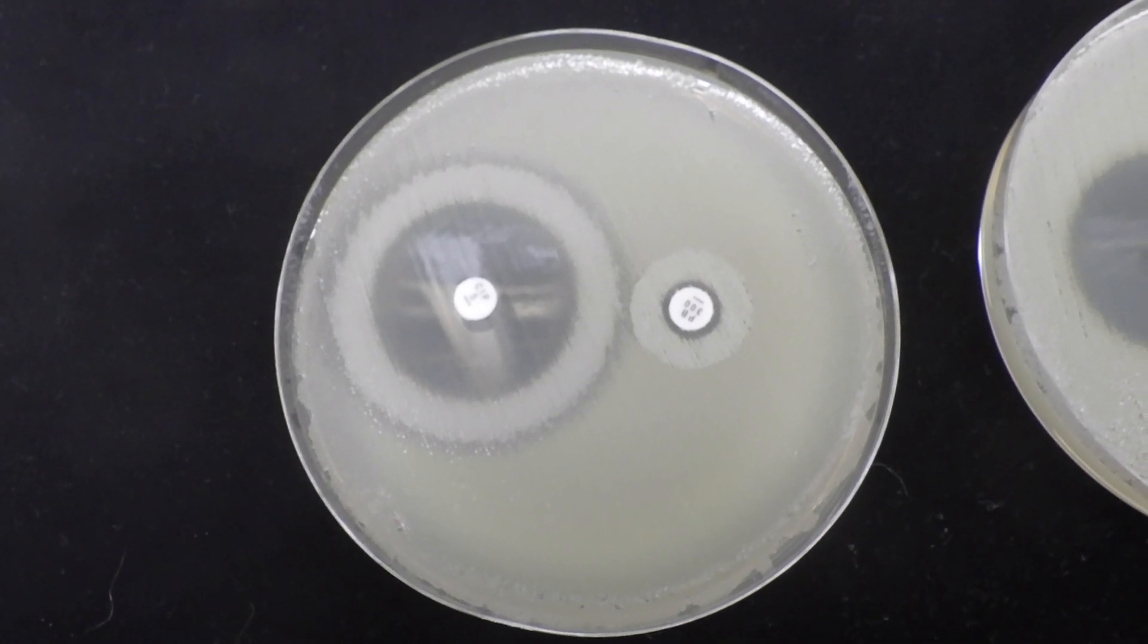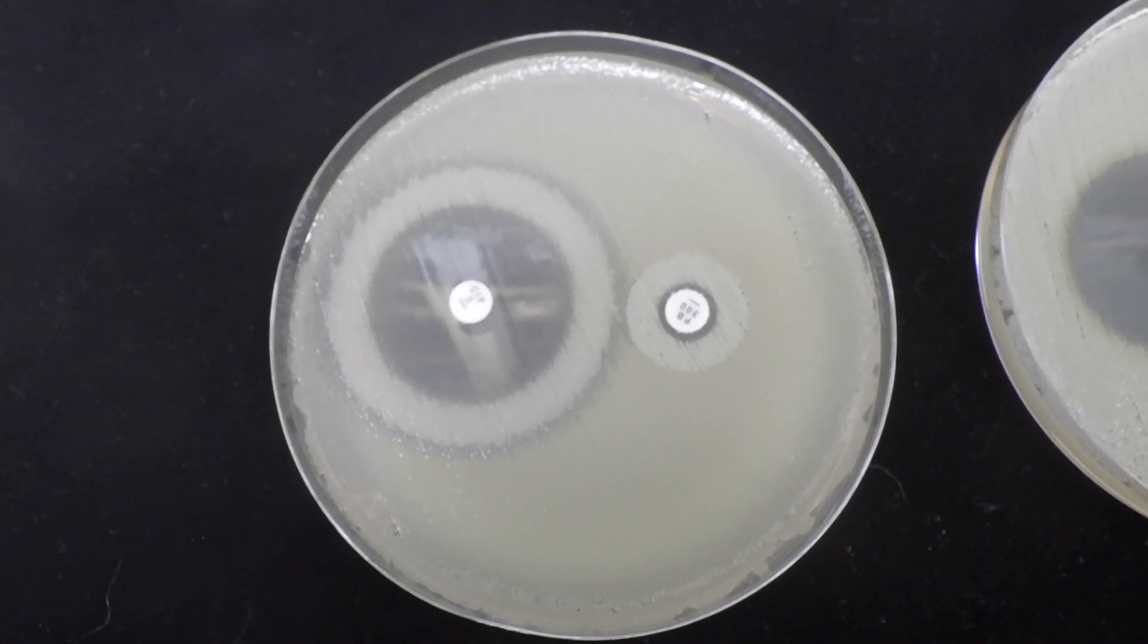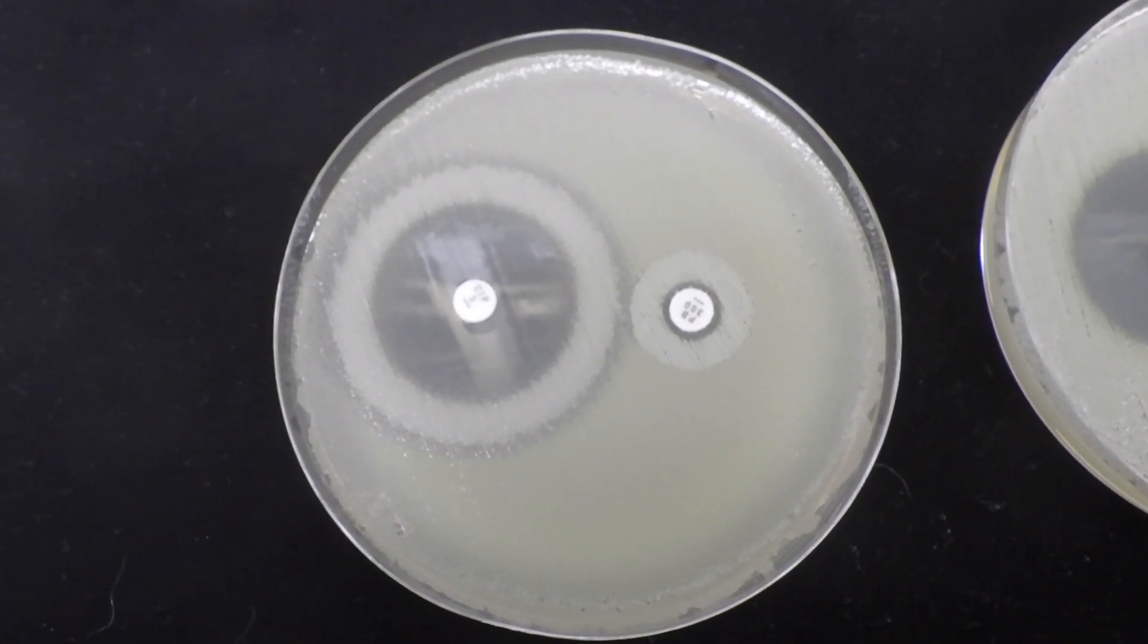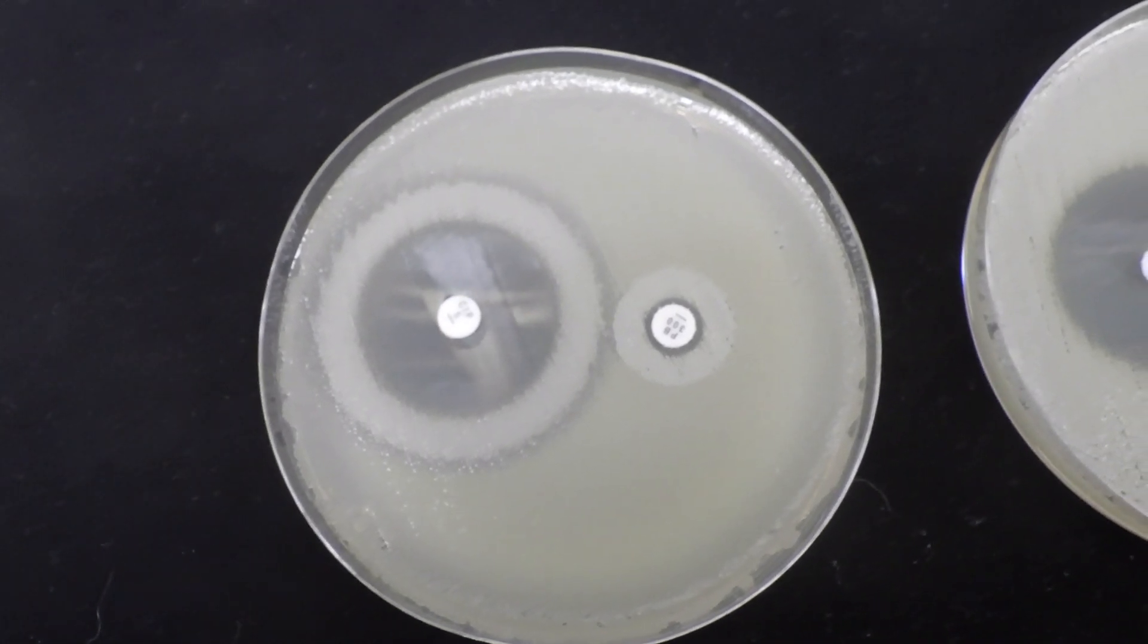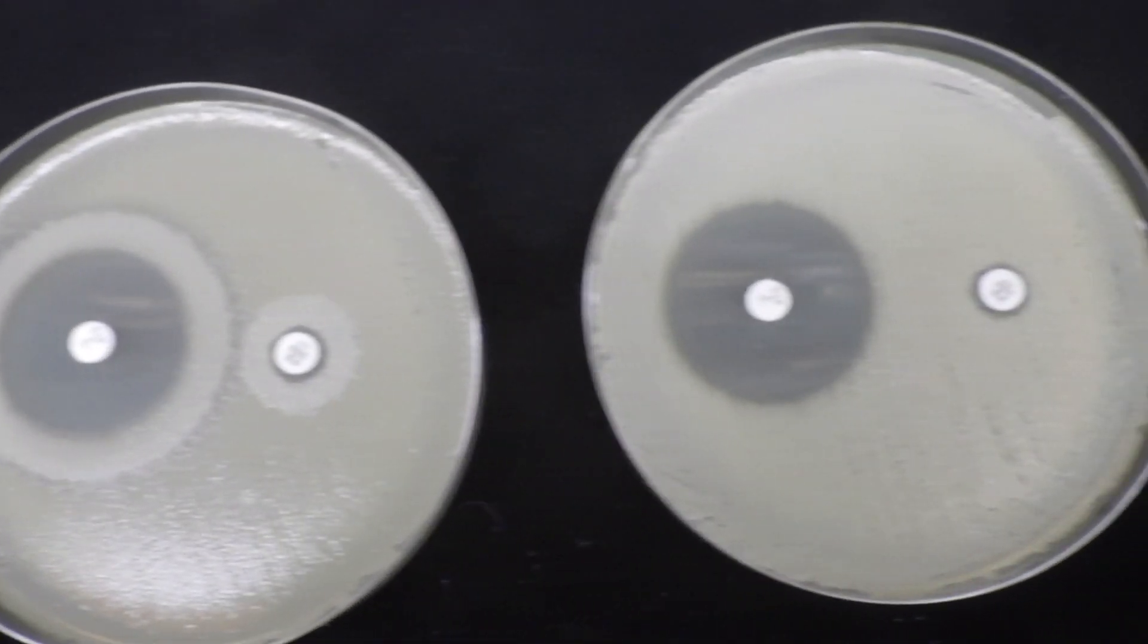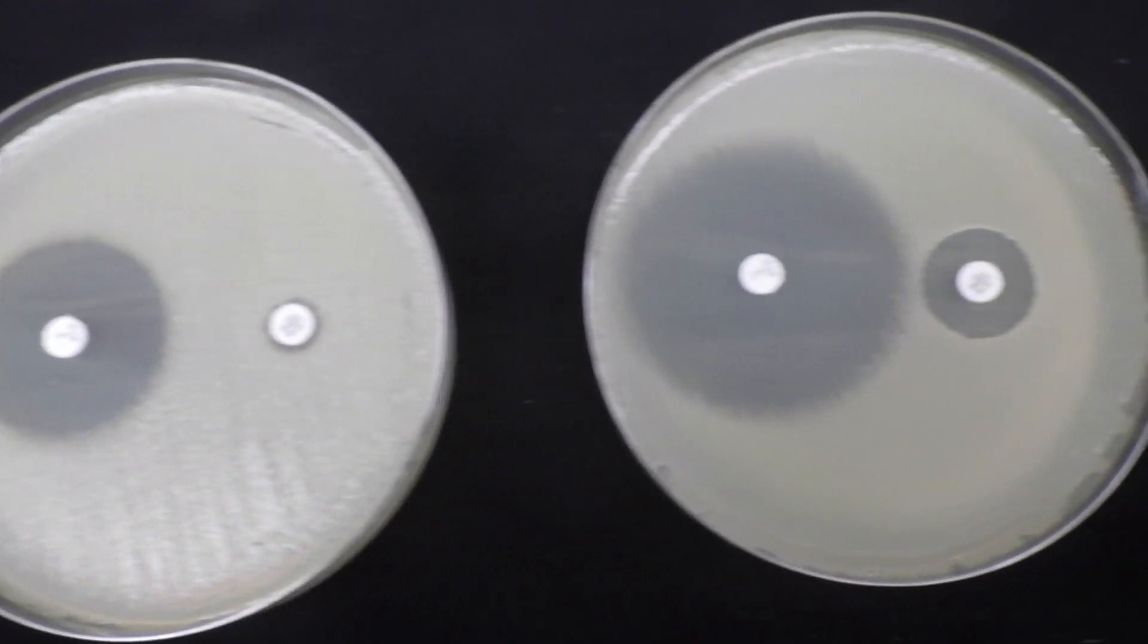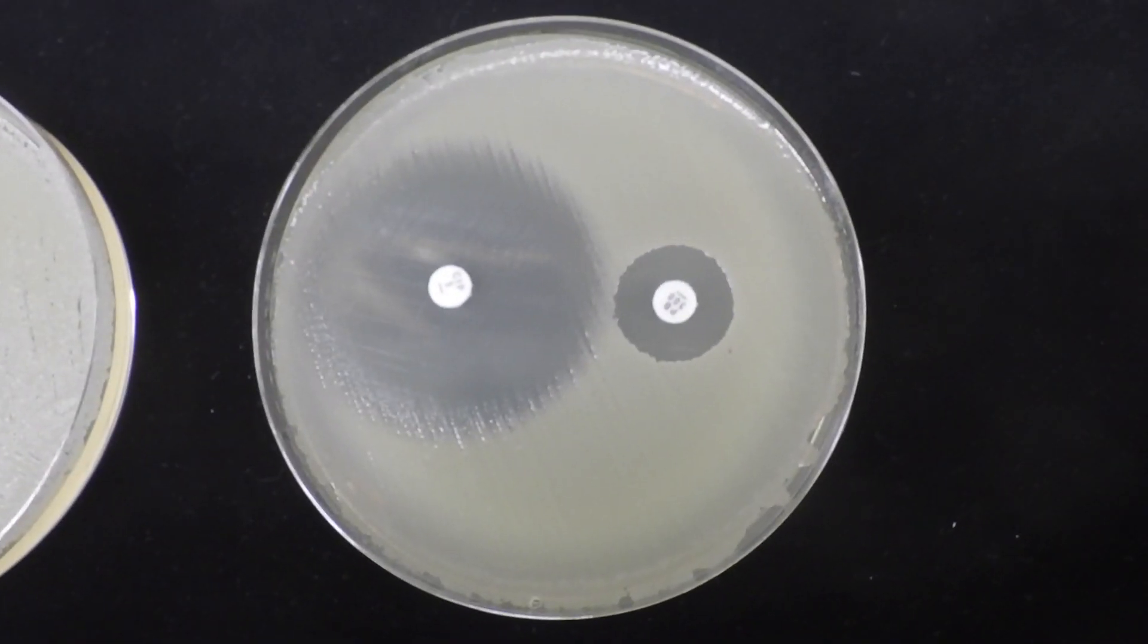On the left what we have is a disc diffusion test done with a mixed culture of both E. coli and Staph aureus. In the center we have only Staph aureus and then on the right we have a pure culture of E. coli.